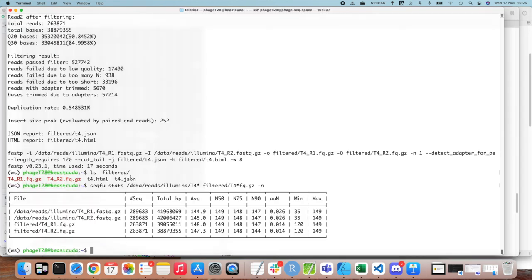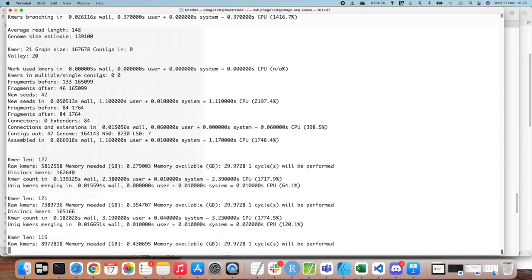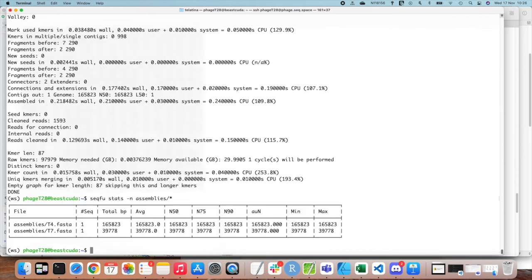Now we can assemble with SKESA using also the filtered reads. Checking stats on both assemblies at once, in both cases we had a single contig, representing probably our complete genome. We can quickly check if the size fits our expectations.